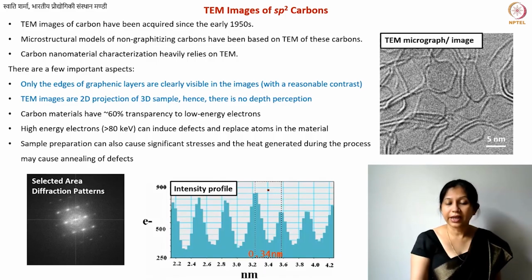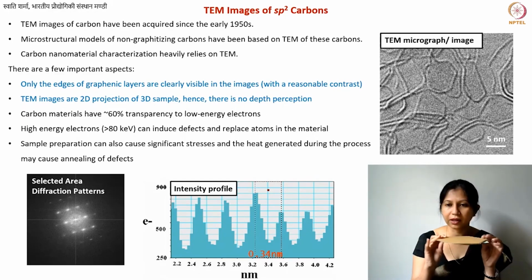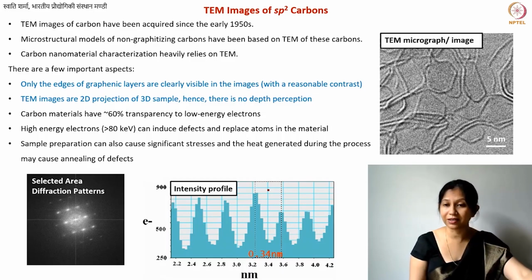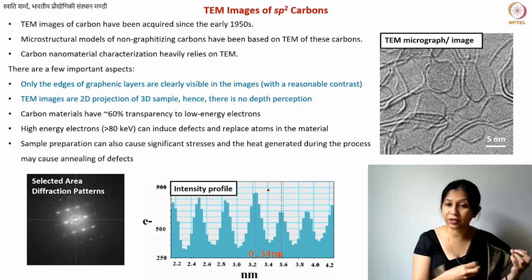Okay. Intensity profiles look like this. This is some green-blue color. It can be any other color, because as I said, this is something that you plot externally. But what you're doing here is you take any local region. If you see, say, stacks of a few sheets, so if you're looking at the cross section, here we have these two sheets. In that case, if you draw a line here and plot the intensity profile, you will know where you have your darker regions and where you have your lighter or brighter regions, and then you can just find out using post-processing what the separation is.